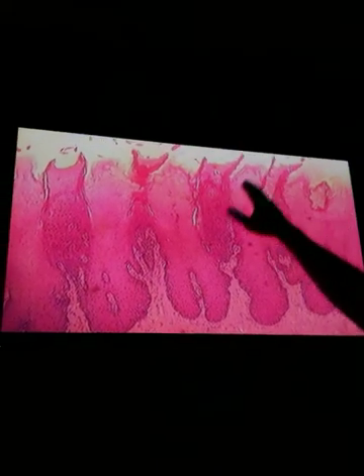You're just going to have to know that they have papillae. Papillae are basically taste buds. This is a filiform papillae, or a taste bud on the tongue. So when you see anything like this, this is the connective tissue, and here's the epithelial tissue, similar to skin actually, but on top you're going to have this rounded area here called papillae. So these right here are actually taste buds on the tongue.